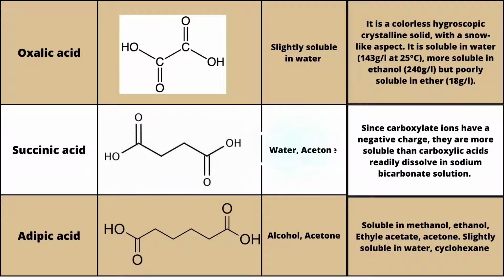Succinic acid, structural formula. Solubility in water, water, acetone. Solubility in 10% NaHCO3: since carboxylate ions have a negative charge, they are more soluble than carboxylic acids, readily dissolved in sodium bicarbonate solution.